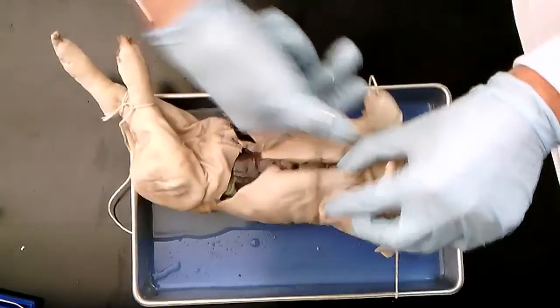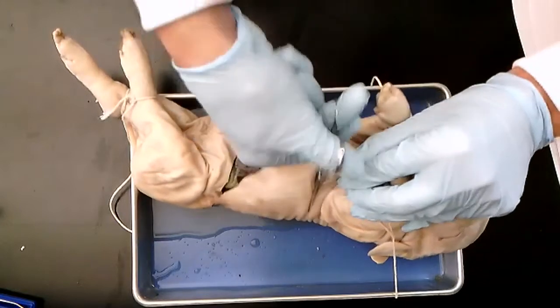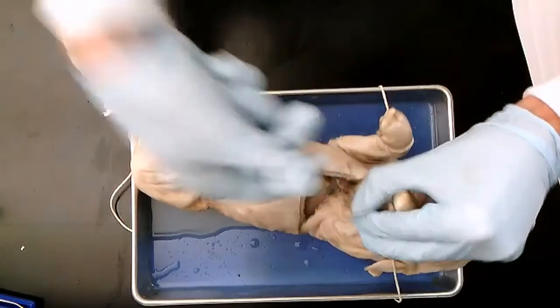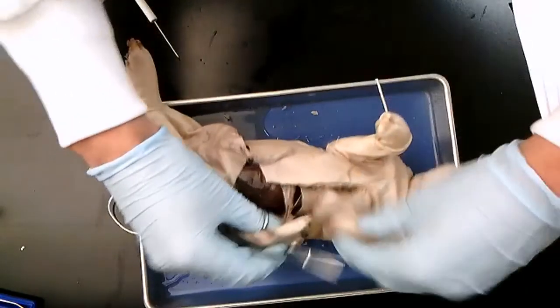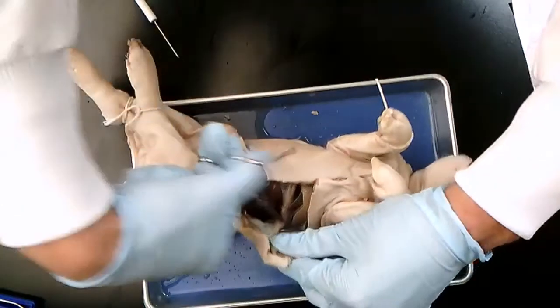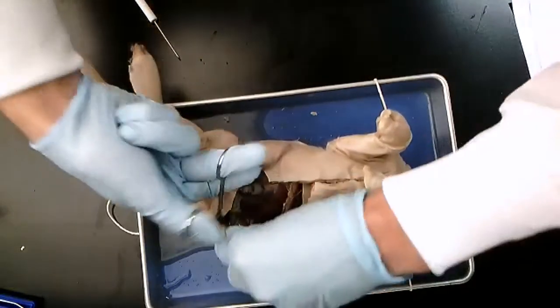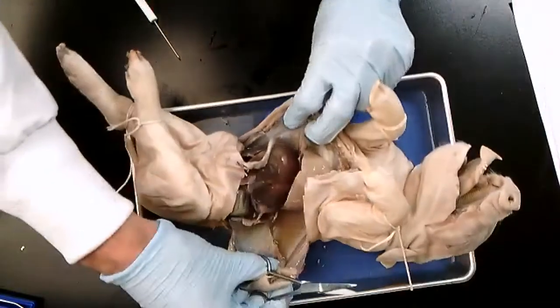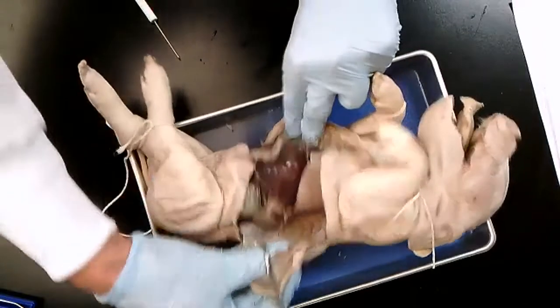Then I would come back near the rib cage and make a flap. So just start cutting with the scissors carefully, not to hit the lungs or liver. There will most likely be fluid. They can kind of drain it or leave it.